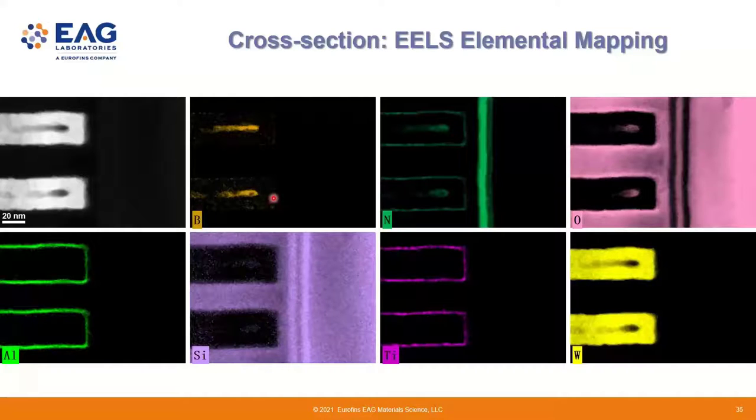Yeah. Makes sense. But then, I've just been thinking about that while you've been talking. And actually, to separate them by fitting, I would just say you just need to have kind of good quality references for the two signals. So you don't necessarily need to get them from the data set internally. You could have an externally acquired boron reference, an externally acquired silicon reference, and then you've basically got very good reference spectra for your fitting for the two signals. And then we'd probably expect it to be a linear combination of the two references. So we should be able to separate them like that. Yeah.